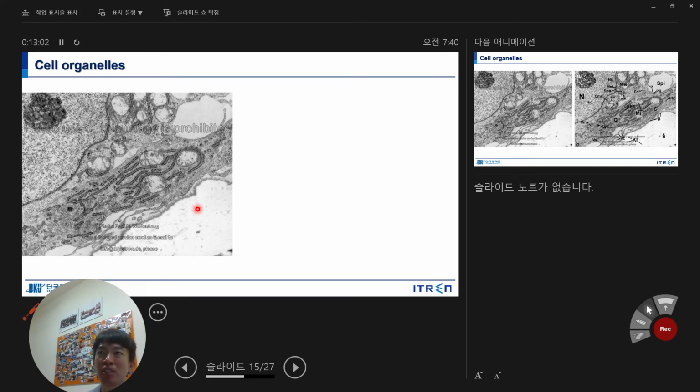So, can you imagine? First, what is the nucleus? This one, right? What is the cell membrane? Maybe this. Okay? What else can you see? The nucleolus produces ribosomes. Okay? Can you see mitochondria here? Oh, I cannot see. Can you see RER, rough ER? Yes. This is all ER and then dots there. So this is RER, okay? And then maybe this can be mitochondria or lipid or some vesicle. But we cannot clearly see this kind of inner structure and two different membranes.